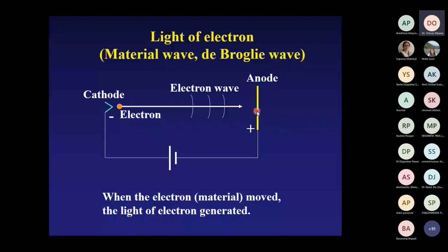In electron microscopy, we can apply this electron wave as phase contrast or electron diffraction, and simultaneously in analytical microscopy, this electron momentum can be detected by energy loss spectroscopy or X-ray analysis. So both wave and momentum phenomena are very important and convenient in the electron microscope.